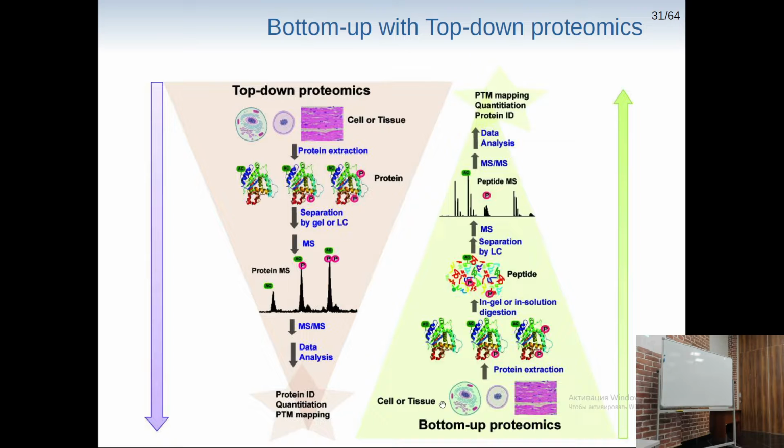Alright then, let's continue. What we've already discussed is that there are two different approaches to how to see our whole protein. We can either get all the proteins and then trypsinize them into small peptides and then work with those peptides. And working with these peptides, we of course can separate them by chromatography, so we are not working with these millions of peptides.